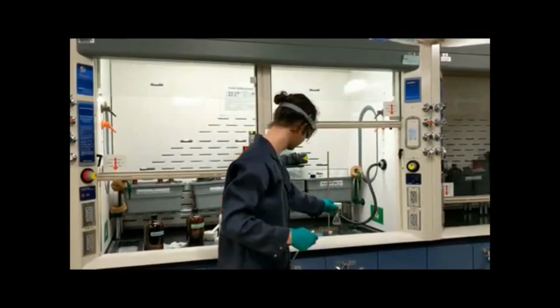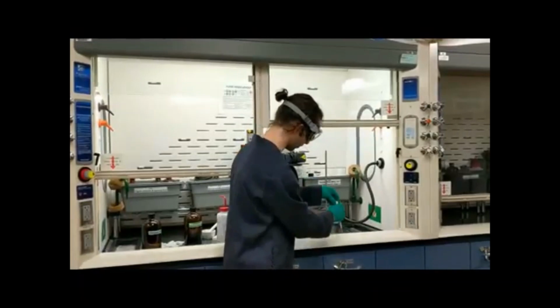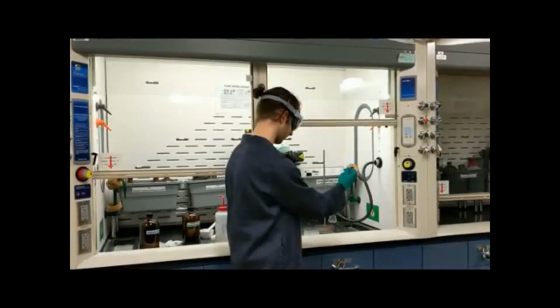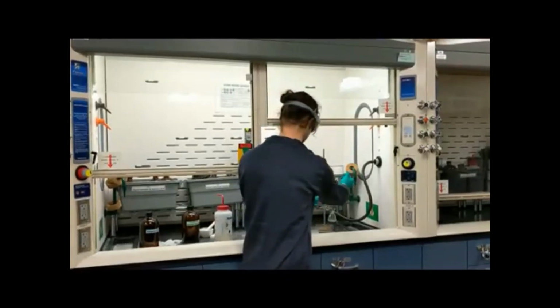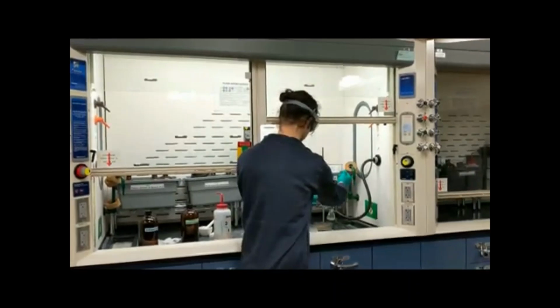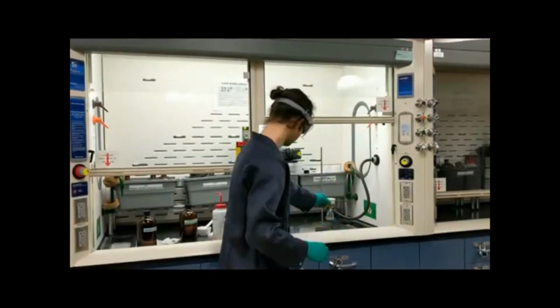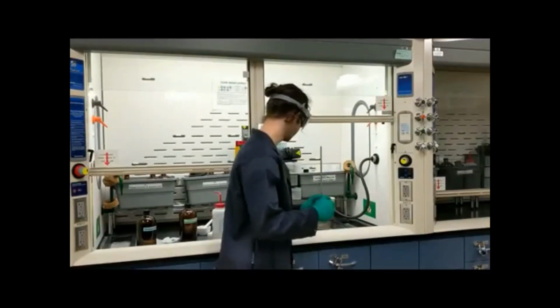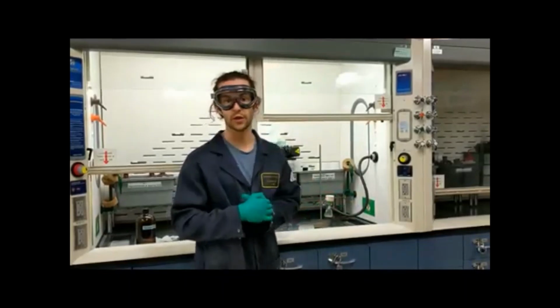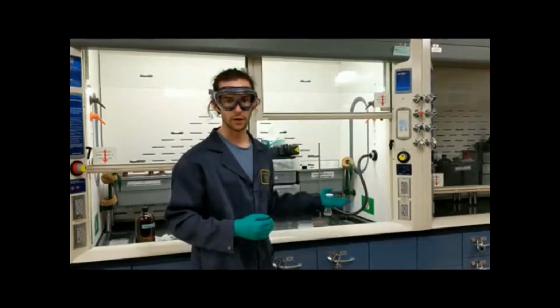As you can see, the liquid has gone through, and there are crystals on the top of this Buchner funnel. I'm going to briefly rinse these crystals with some cold ethanol in order to remove any impurities. At this point, I'm going to let the filtrate stay on the vacuum for a couple of minutes in order to make sure that all the ethanol is off. And then we can take a melting point, prepare a sample, and make an NMR of our crystals.